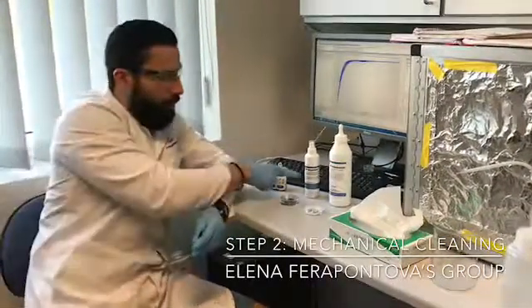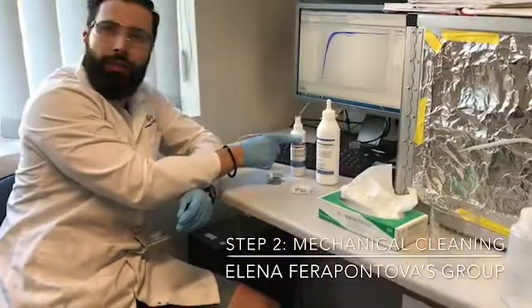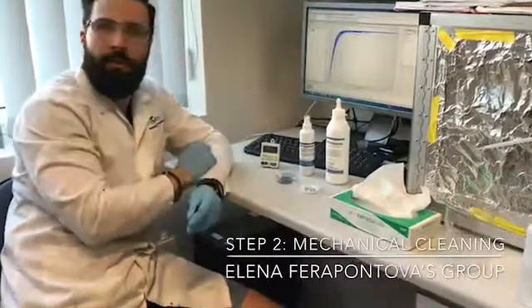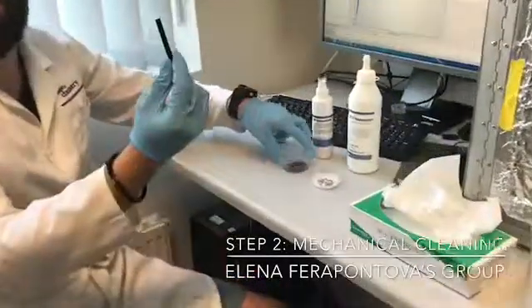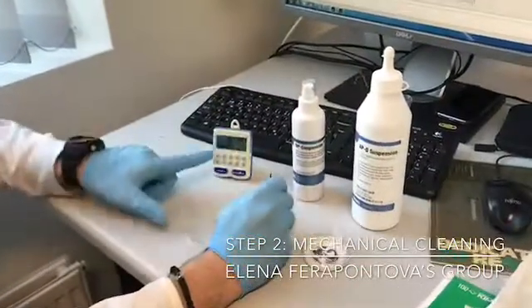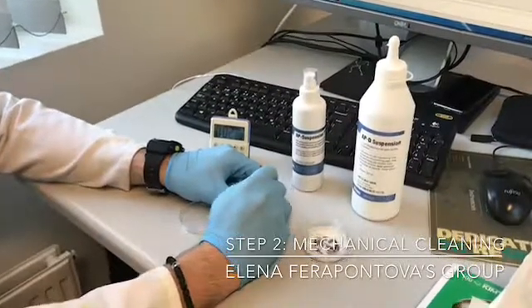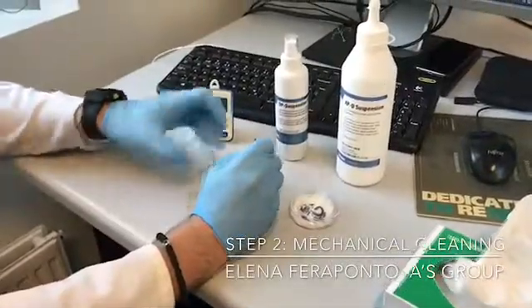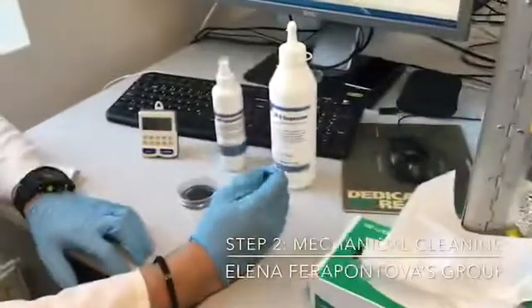For this you need a 1 micrometer diamond paste and a 0.1 micrometer alumina slurry, and you need a polishing pad. Once you put each one of them onto the pad, you take the gold electrode and then you start polishing for two minutes. What you need to do is draw figure-eights all the time. Once you finish with the diamond, you wash it and then you do it with the alumina.